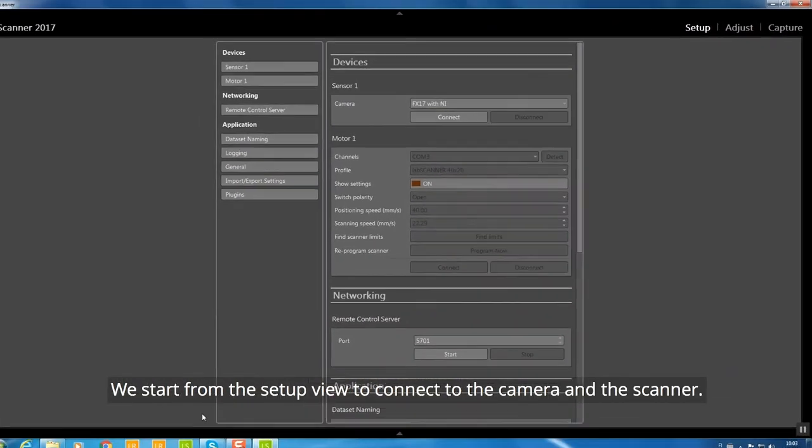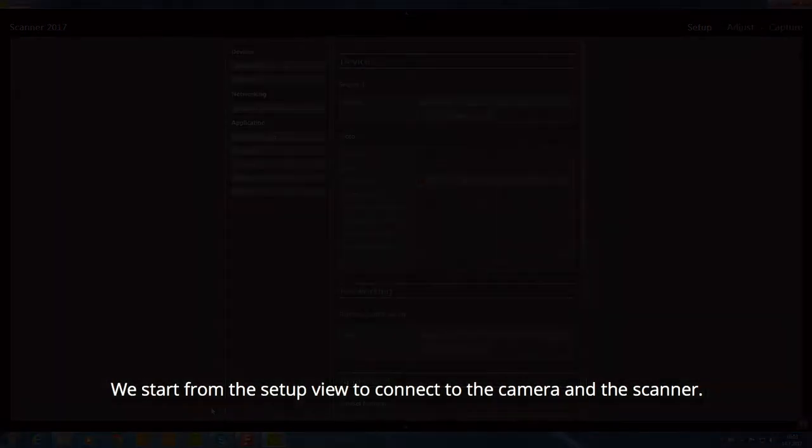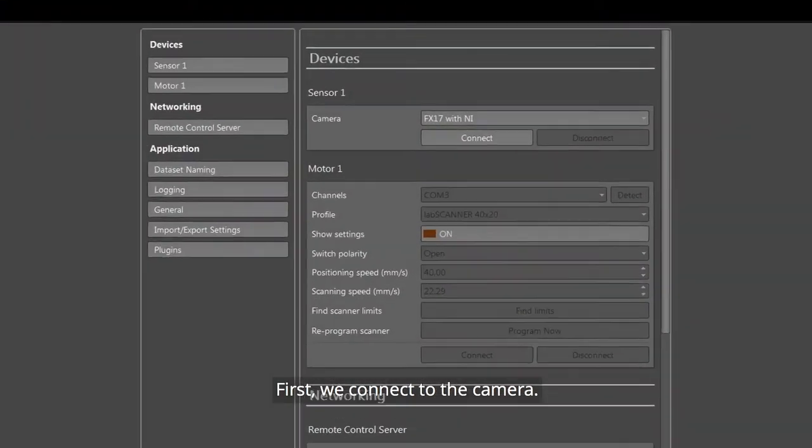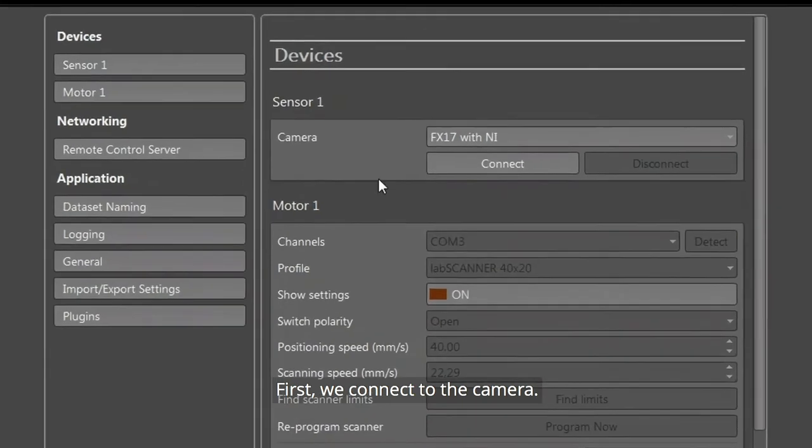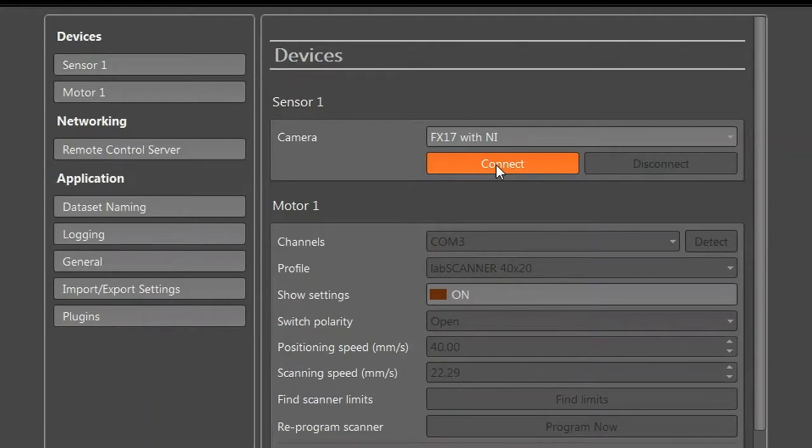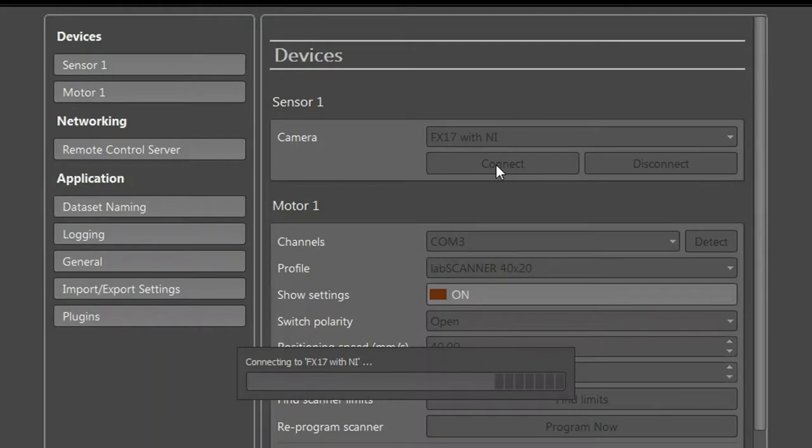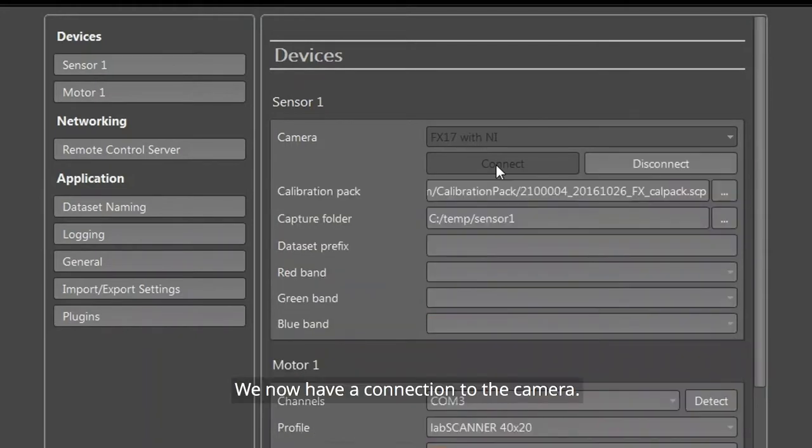First, we connect to the camera. Click Connect. While connecting, a status bar is shown on the screen. We now have a connection to the camera.